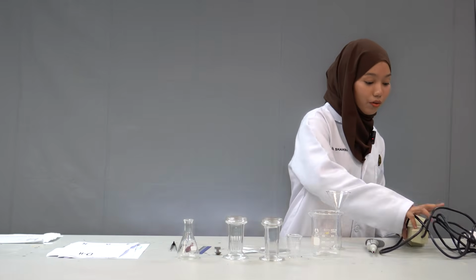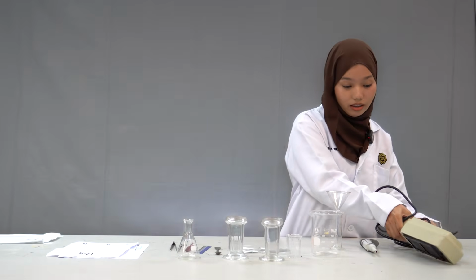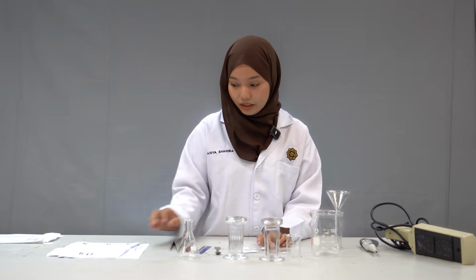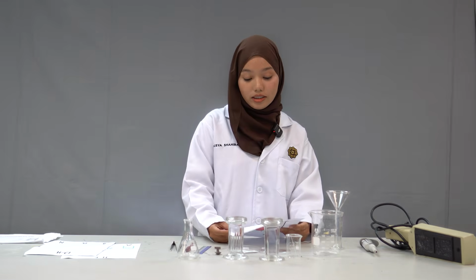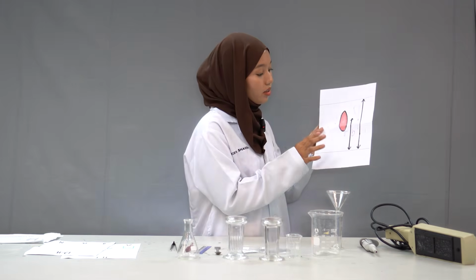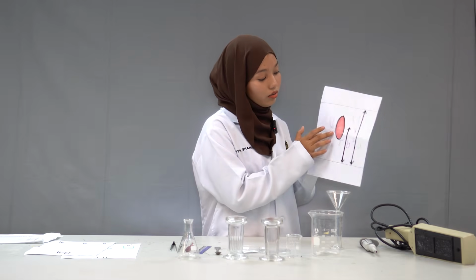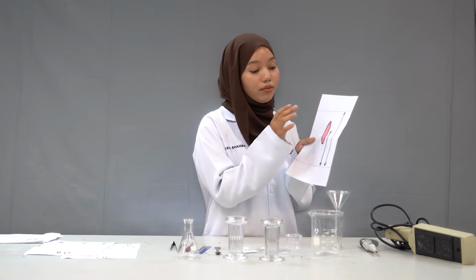But we cannot use our naked eye directly, so we need to use UV light to visualize the spots and outline each of them. Finally, we can measure the retardation factor, which is B over A. For B, we measure the distance from the baseline to the center of the spot, and for A, we measure the distance from the baseline to the solvent front.